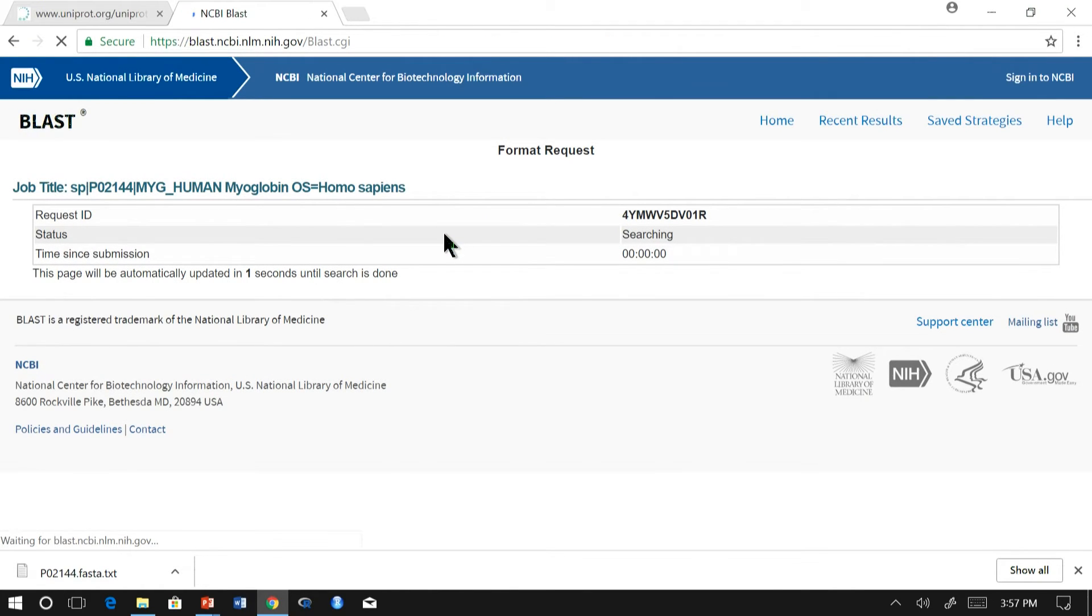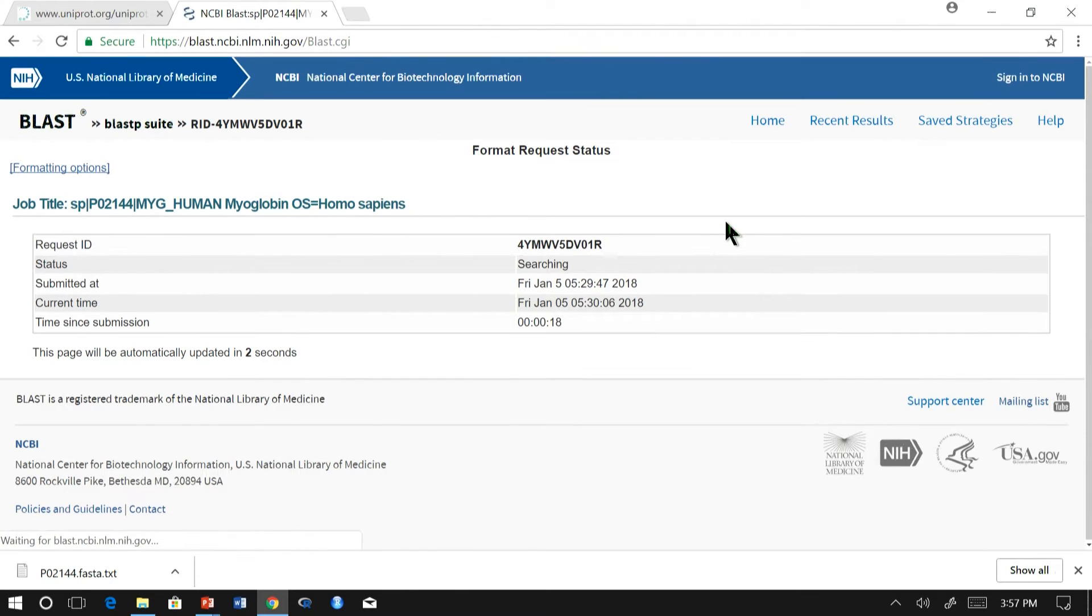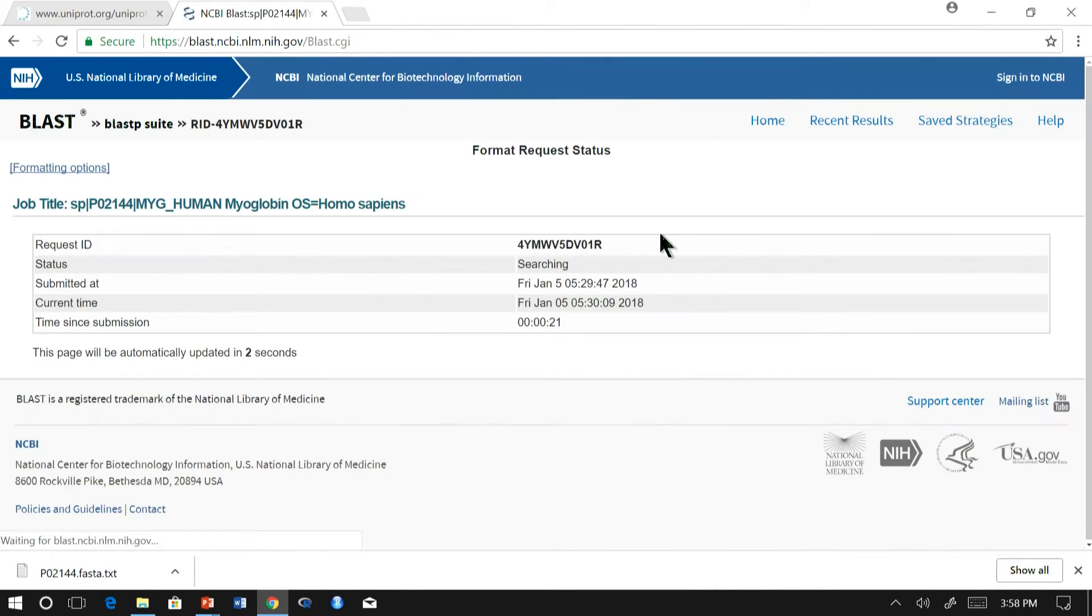Now that we have submitted a job, the job is being processed. Note down the request ID in case you are going to scroll from the browser. I am waiting here for the results.